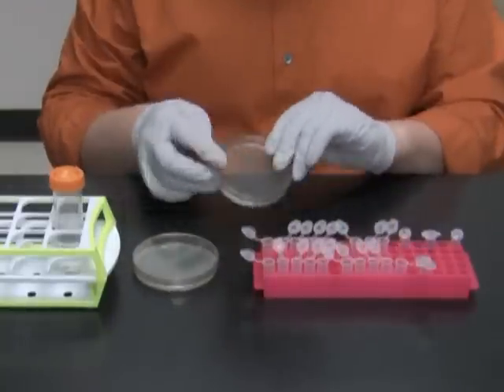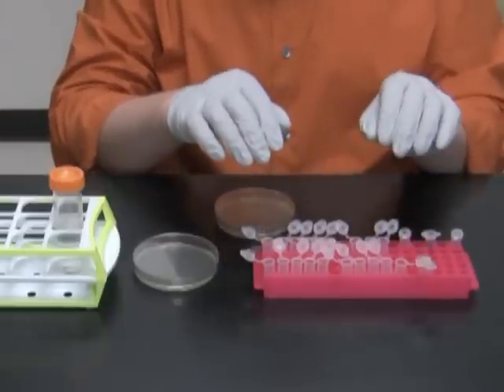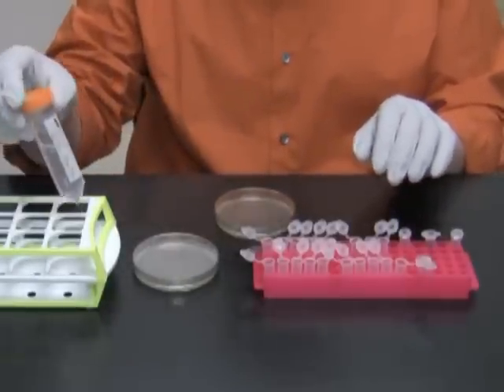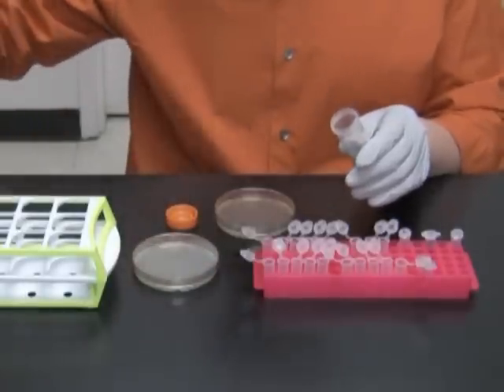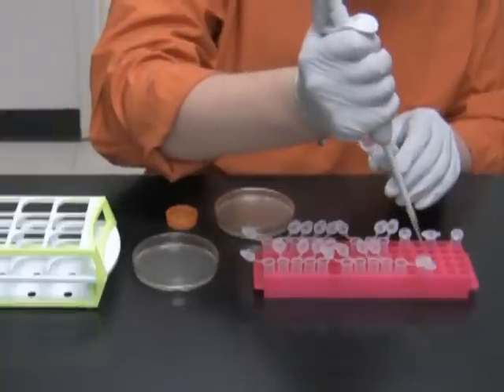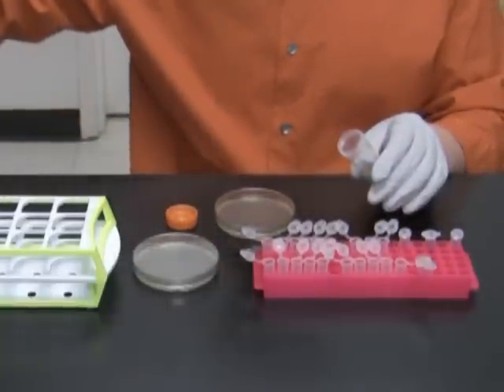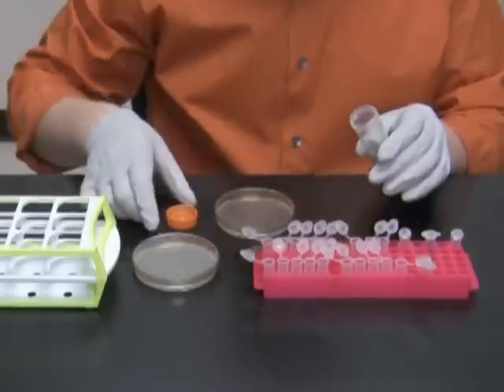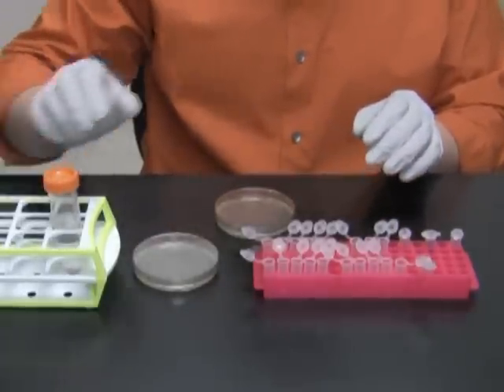I will keep this plate at 37 degrees overnight. Once all the cells are in, I am going to lyse them by adding 20 microliters of the cracking buffer to each of the tubes. Notice that there is no mixing involved with this step.